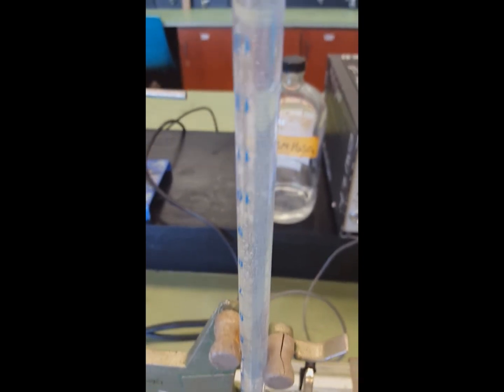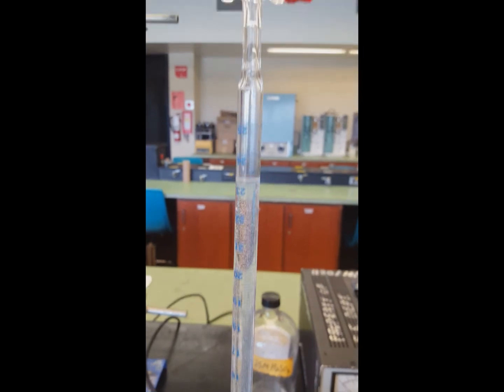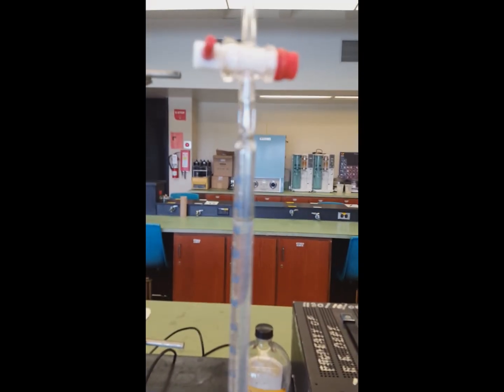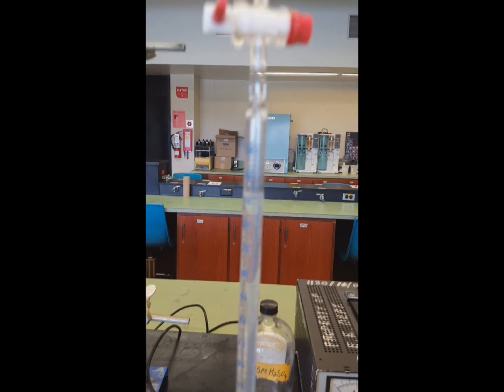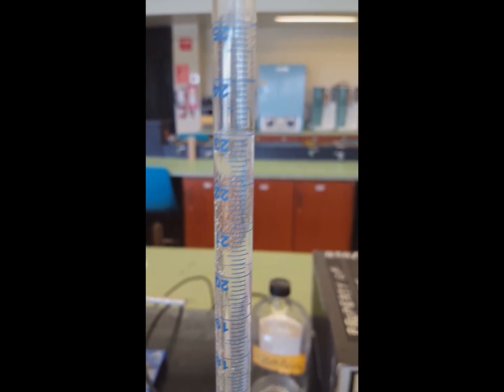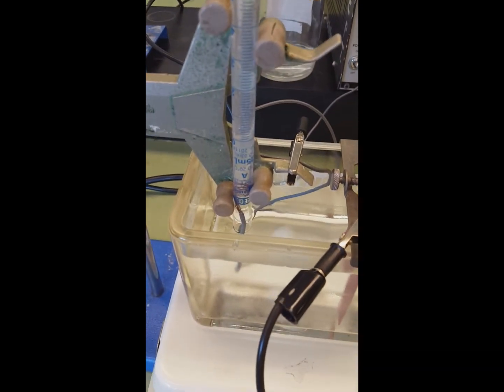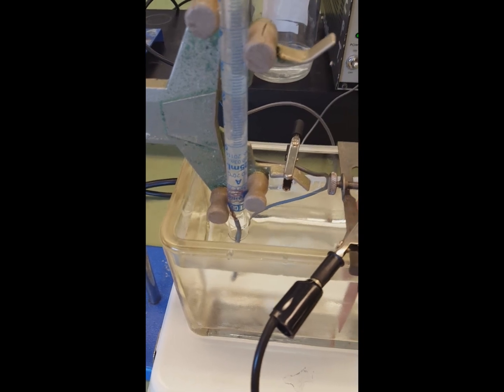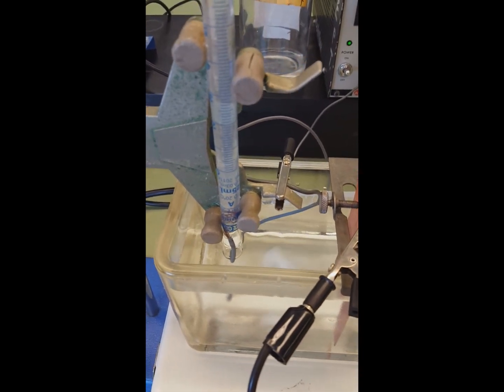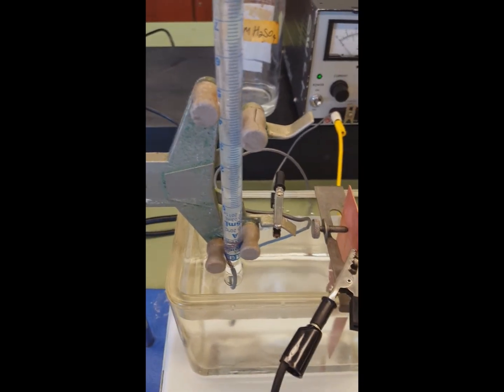So with the burette filled with liquid to the 25 mil mark, you turn on the power supply and start your timer. Now, as the hydrogen gas collects to the 24 mil, to the 23 mil, to the 22 mil, and so on, for each milliliter of gas collected, record the time, record the current in milliamps, and of course record the voltage. That should be steady at 5 volts. Using that information at the end, you can plot the rate of hydrogen gas being formed. And you can also plot the current, which should be a flat line.